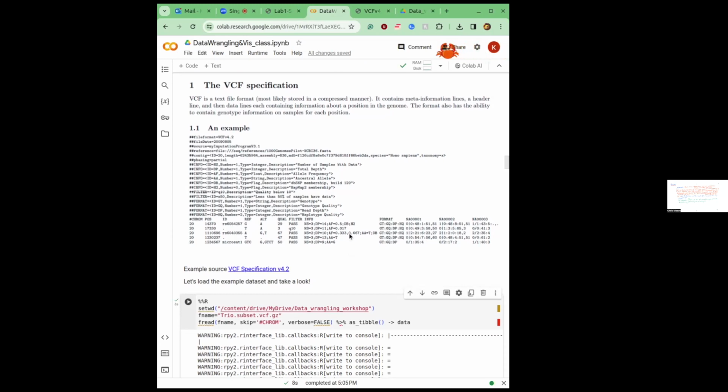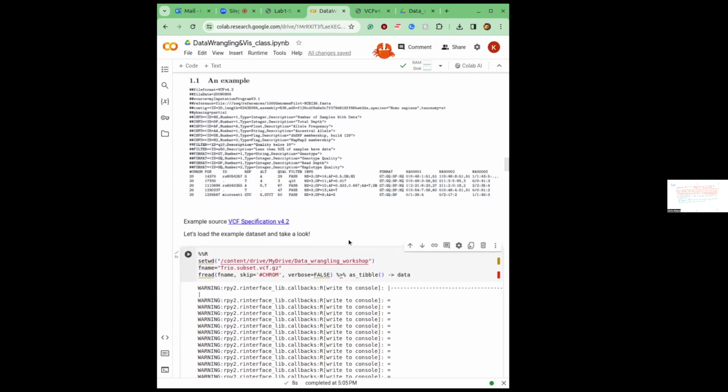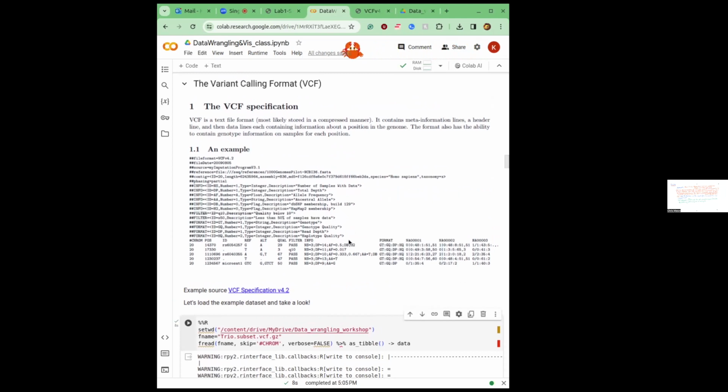And this is the part where we go over it and try to figure out what exactly is here. I know that I've seen a couple of non-standard VCF files, like some of the newer technologies, like Ultima, like to give us new surprises, giving us non-standard files. But generally, this VCF file has a specification that is pretty well established.